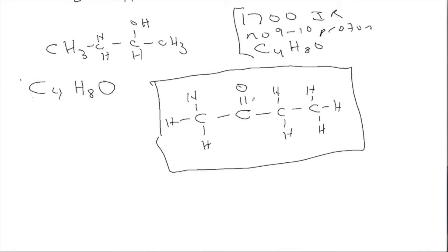So it's very helpful to identify the type of functional group and then work away from the functional group. That's just something else I wanted to point out. But you guys did a good job on that problem. That was a good, efficient way of working out the structure. I just wanted to point out how much information we could squeeze out from just these ideas.